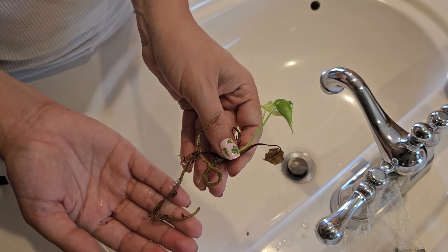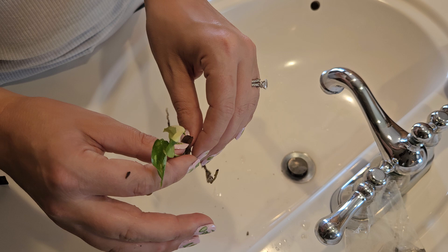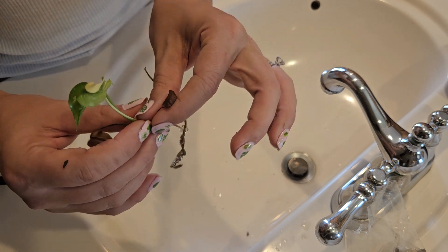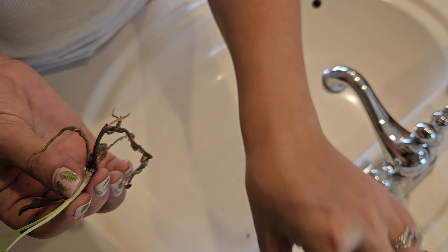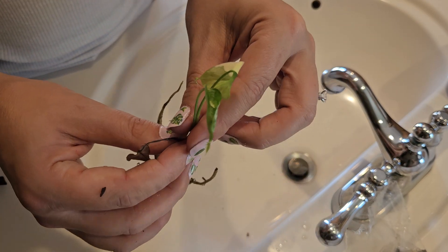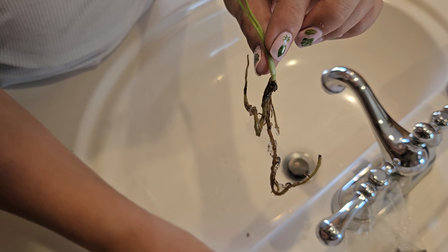Now that we've removed our tissue culture from the gel, let's go ahead and trim it and wash it really well. You can use a pair of scissors or, if you're like me, you can just pull them off. It's not going to hurt the plant — they are not as delicate as most people think, so you can just pull them off.